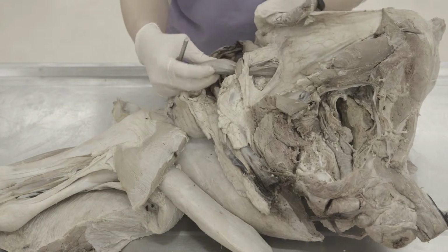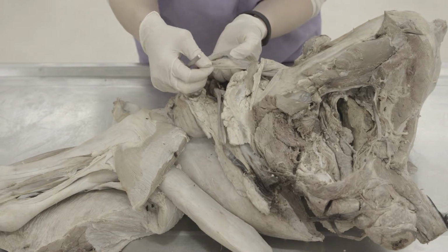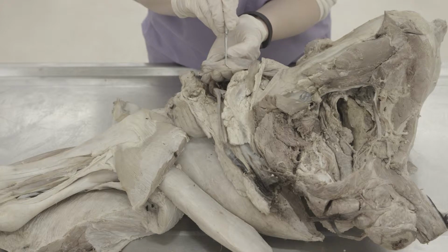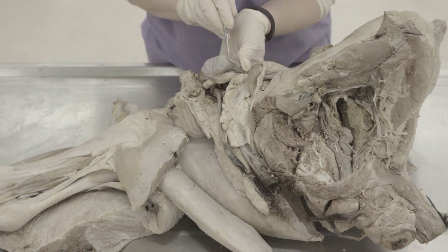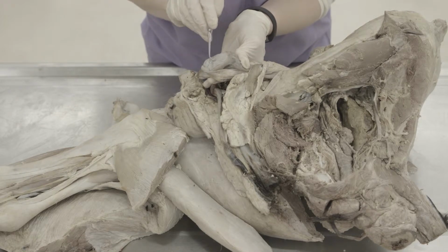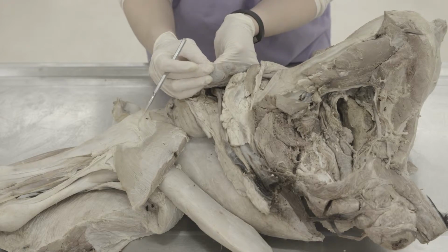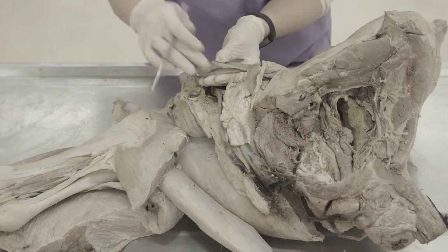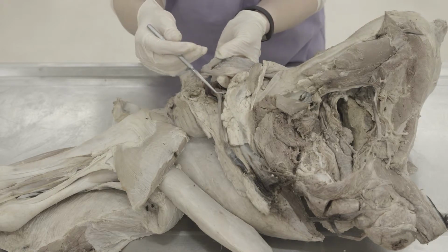And I've cut open the vaginal tunic. So here you would have the vaginal tunic opened up. And so I have parietal vaginal tunic would be here, so that's the wall. Then I would have visceral vaginal tunic that's tightly adhered to the testis itself and the epididymis and the ductus deferens. So visceral vaginal tunic, parietal vaginal tunic lines the wall, and that's what you're cutting open to get into this space.